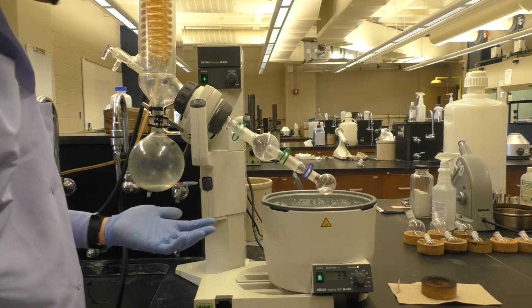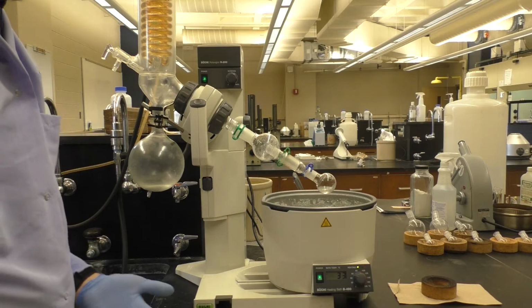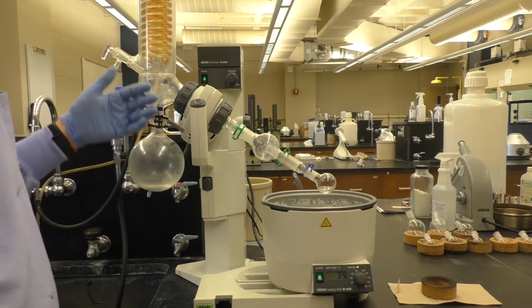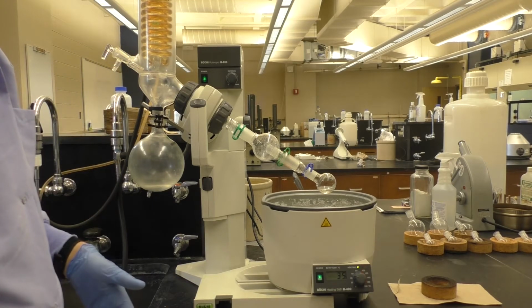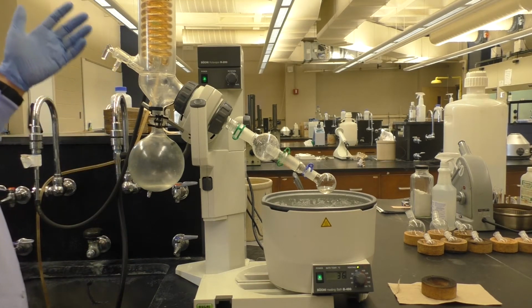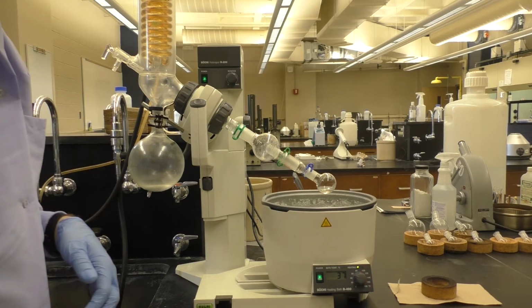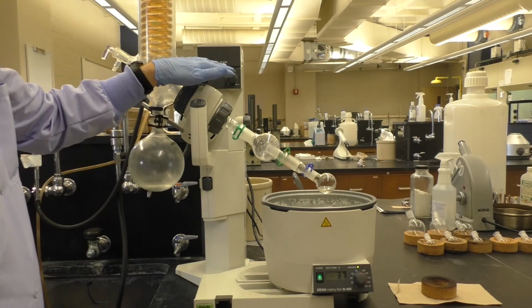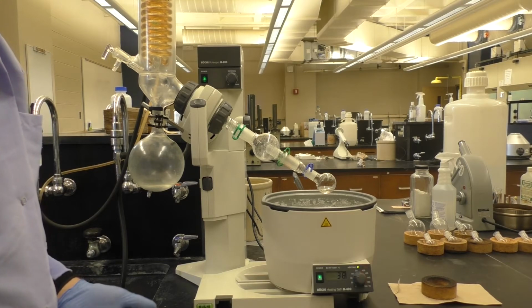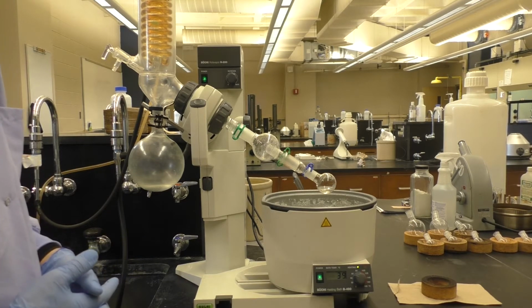And so what this allows is for the system to remove solvent at a much, much faster rate than you would be able to do simply heating on a hot plate in a hood. Plus, you are also able to collect the solvent as opposed to just dispensing it into the air in the hood. And so we'll turn on the water aspirator to pull a vacuum and then lower this into the bath and turn the rotation on. And we'll see, it should only take a few minutes to remove the solvent and leave us with a product as a colorless oil.